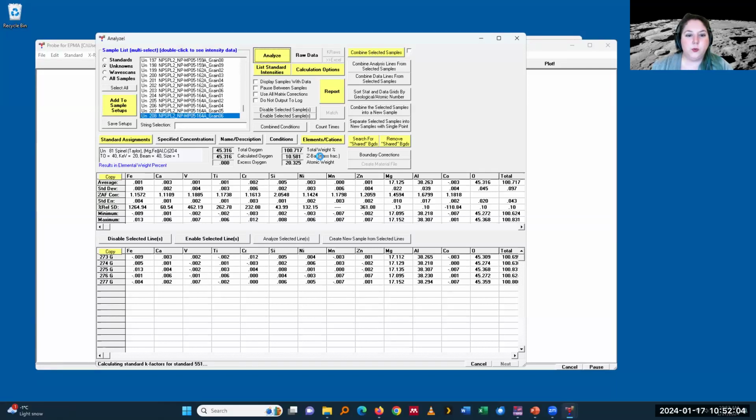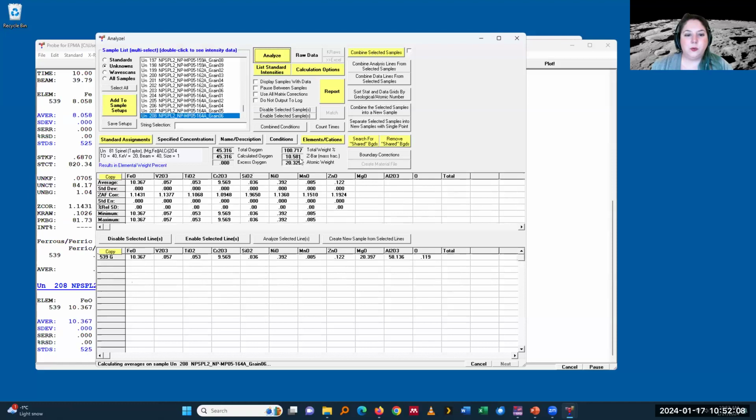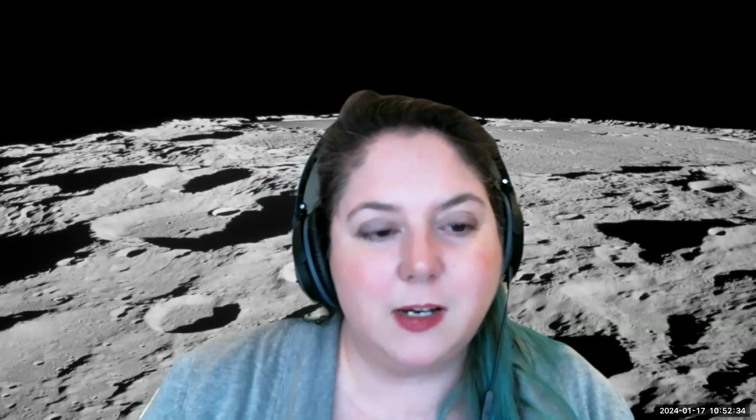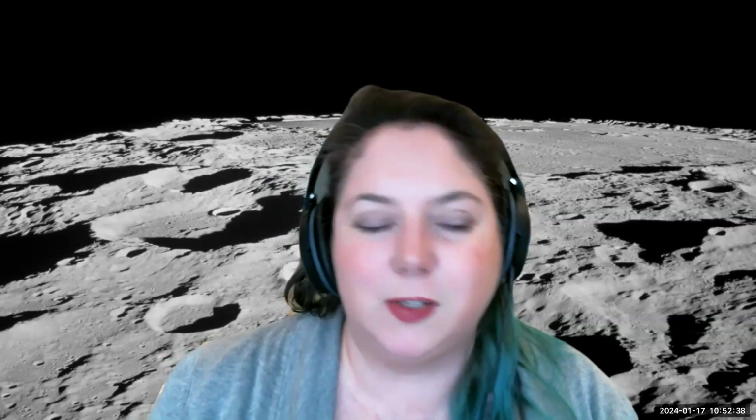when you do an analysis, it shows here in the analysis window your calculated Z bar. And so with that, you can kind of get an idea what the range in your samples is, and you can sort of look through your standard collection and pick some for the high end and the low end and the intermediate ones. So that can be quite useful then to start the process. And then you will inevitably find out that this has 200 ppm of magnesium, and that has, and again, then you learn eventually like, oh, this one is really pure and works for a lot of things. And that's also where sometimes with standards, you can put a gallium arsenide in or something that has nothing to do with your geological materials, and that can be a great MAN standard for all your other analysis, unless they're interference corrections.